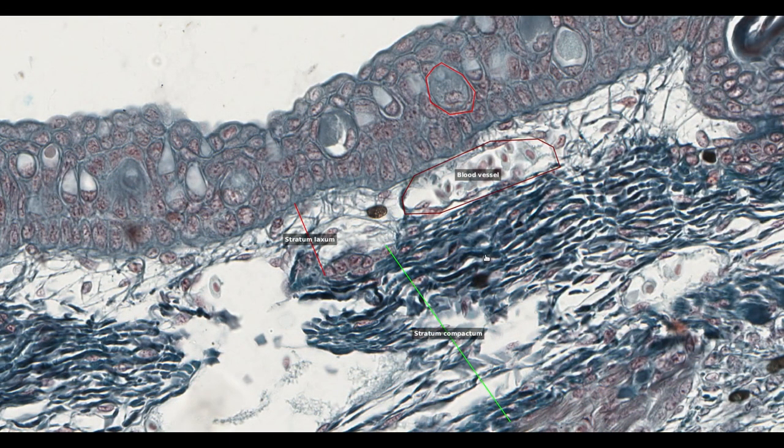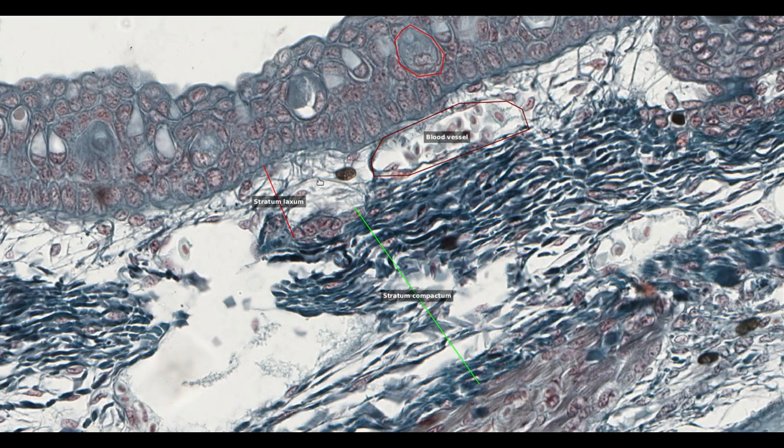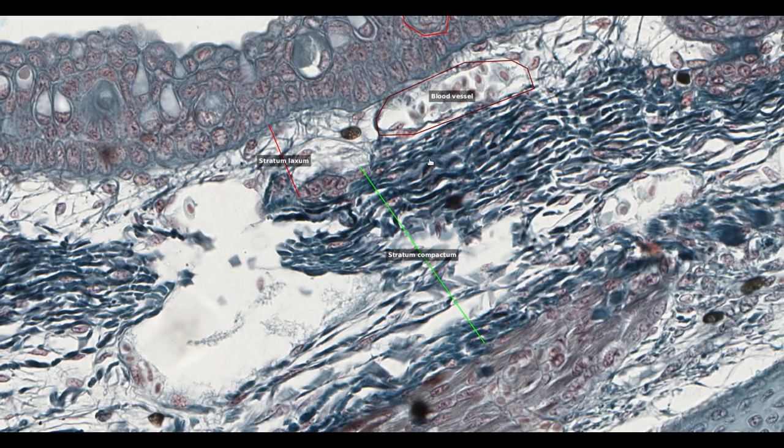Returning to slide 249, we can venture down into the dermis. The dermis is also made up of layers. That immediately below the epidermis is called the stratum laxum. Here we can make out loose connective tissue interspersed with blood vessels that will be providing the epidermal cells with the oxygen and nutrients they need to survive. The layer below that is formed of dense compact collagen fibers and is therefore called the stratum compactum.